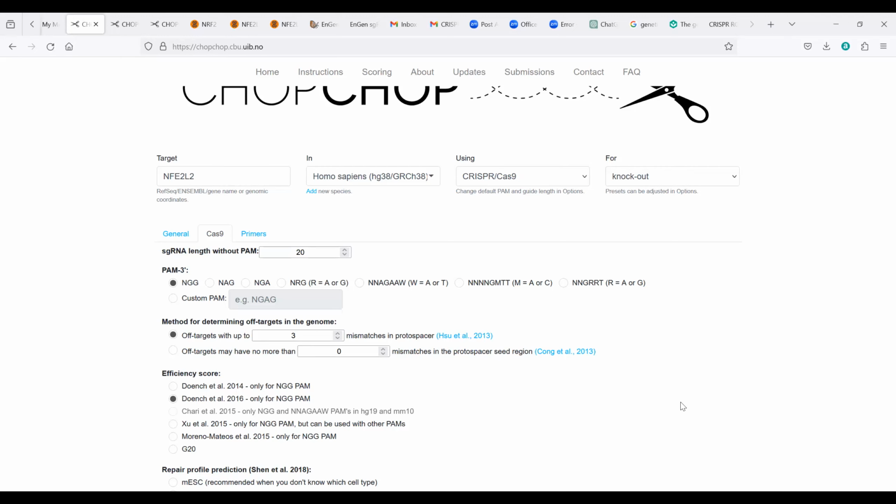So for the protospacer region I'm selecting, is there any sequence which is similar? It may not be identical. Even similarity is enough for off-target editing. Off target means that other than the intended target, Cas9 goes and edits unwanted sites. To minimize that, we have to select a target sequence which is unique to the gene.